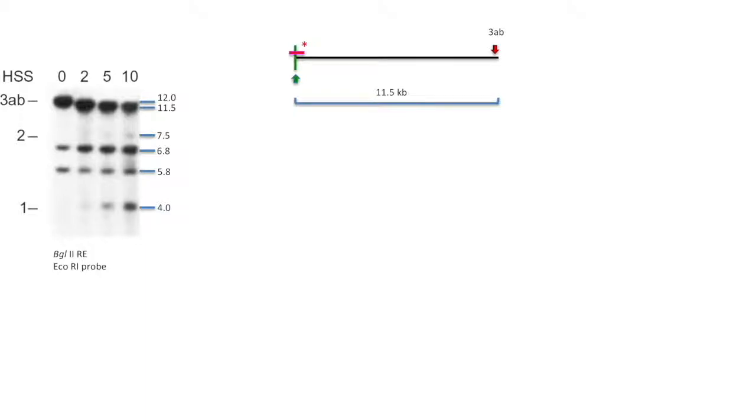If the gel is run longer, then we might be able to distinguish the two like the first experiment. The next one we barely see is 7.5 kb, which they labeled as hypersensitive site 2.